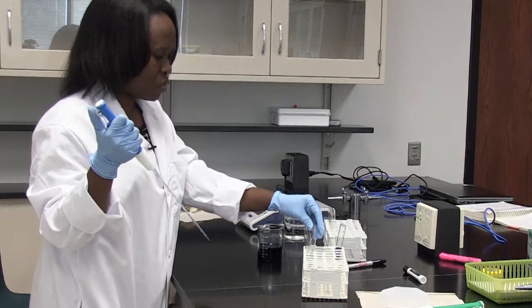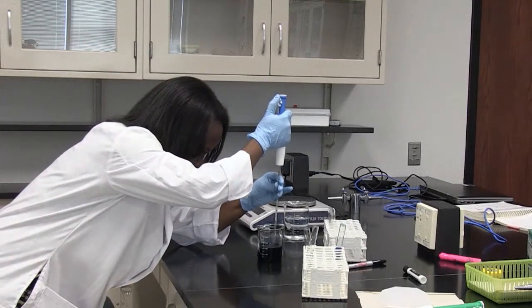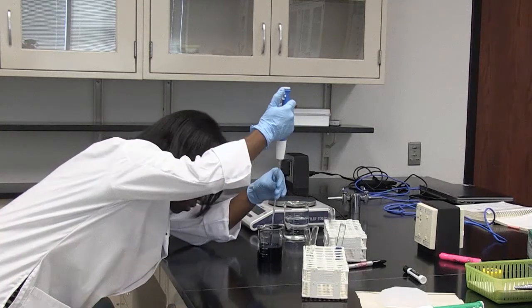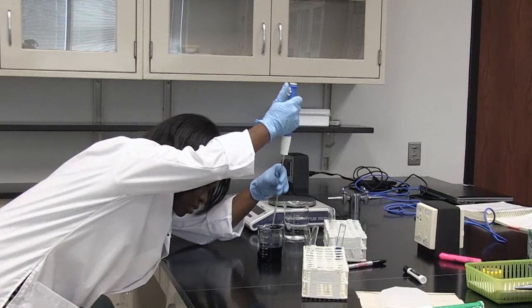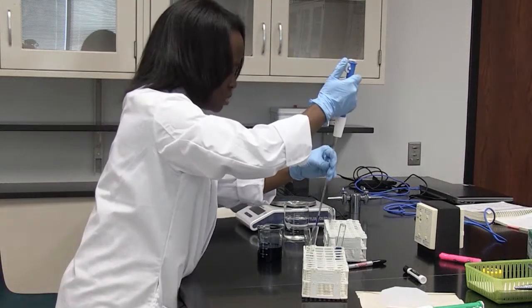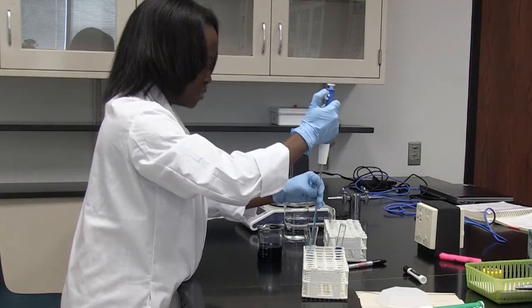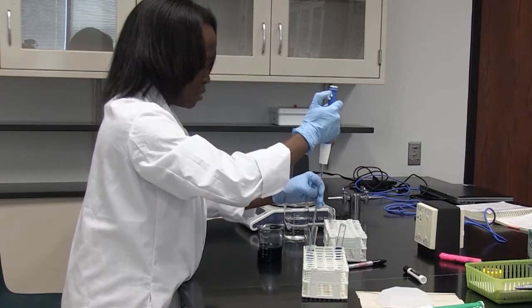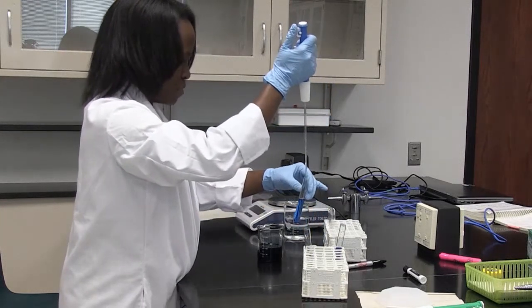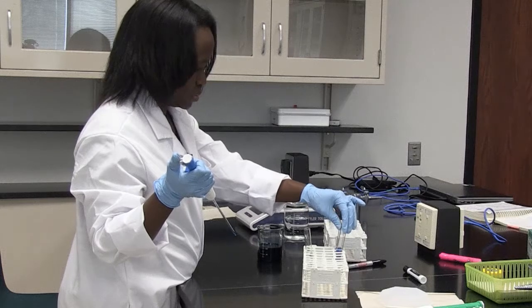Now I'm going to make the 1 in 50 dilution. I do this by adding 0.2 ml of stock dye to the water in the second test tube, and I pipette up and down like before. I have now made my 1 in 50 solution.